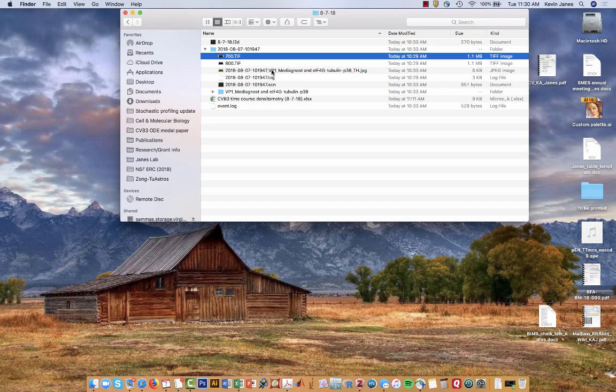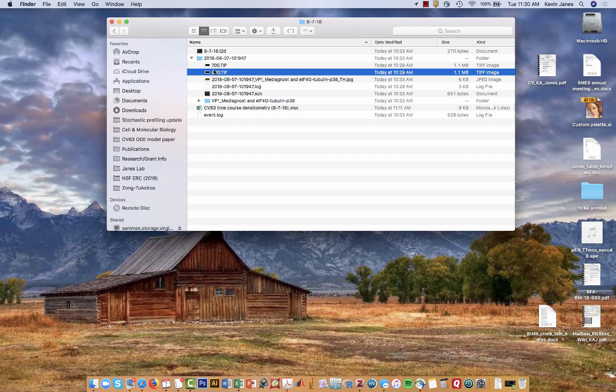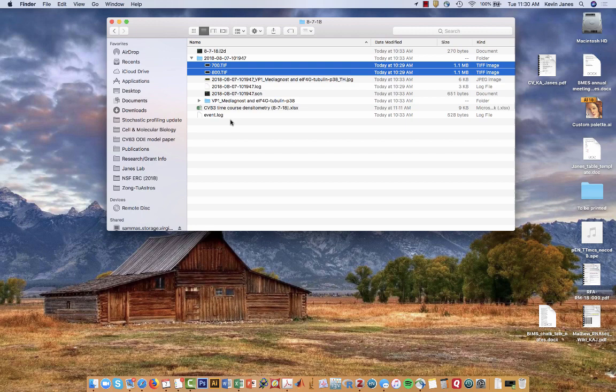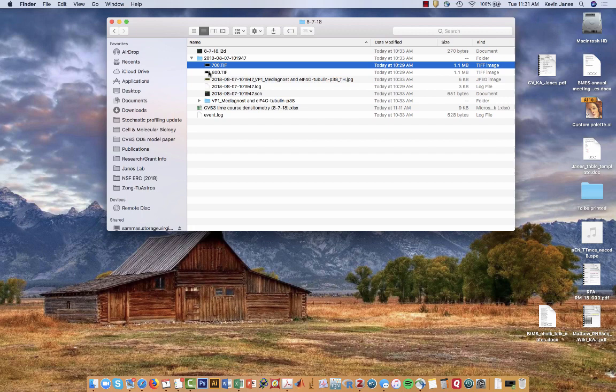We're going to start with the set of raw files that come off the Lycor Odyssey instrument. First thing to emphasize is that all quantitative analysis should be on the raw 16-bit images that by default are saved as 700 and 800 TIFF files by the Odyssey software. Any of these other logs or JPEGs are colored or processed displays of the raw information. We want to make sure we're always working with the 700 and 800 TIFFs and keep track of what antibodies we're monitoring in the 700 or 800 fluorescence channels.